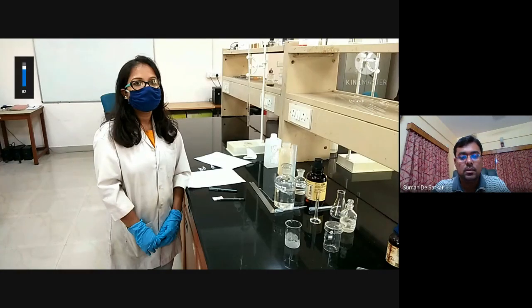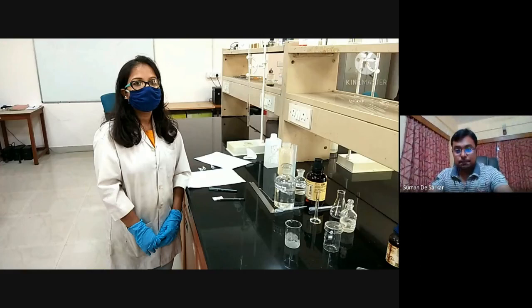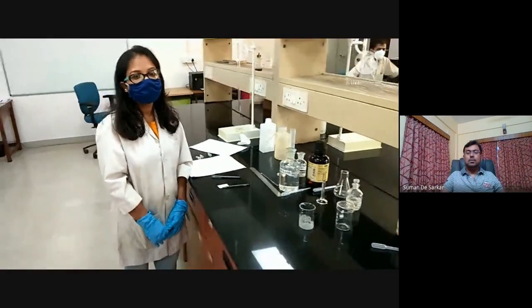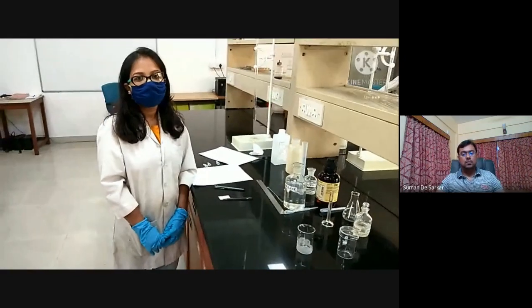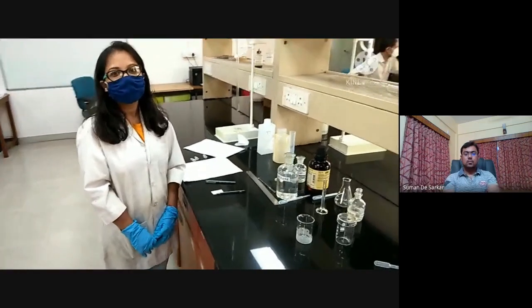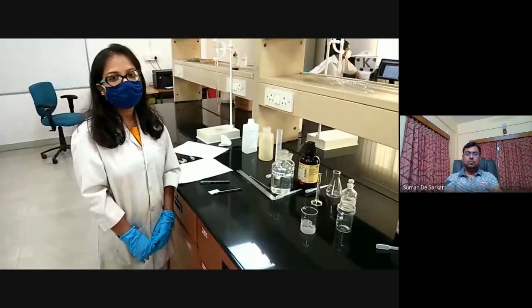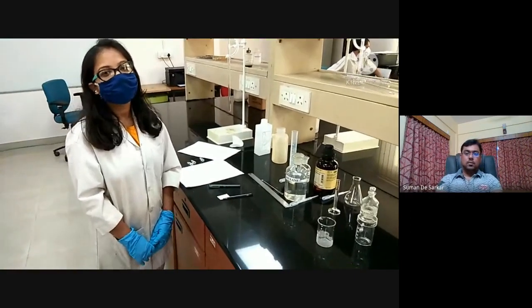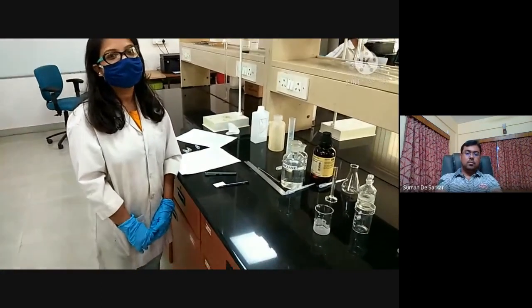And see, she's taking really good protection because phenyl hydrazine is toxic. So the lab coat and gloves are mandatory, and of course she's taking extra protection because of COVID. Okay, welcome to this new experiment for the synthesis of indole. And today Nidhi Kumari is here, who will help us in doing the experiment and will show you how to prepare the indole using phenyl hydrazine and acetophenone.